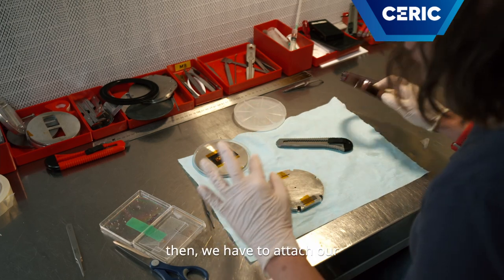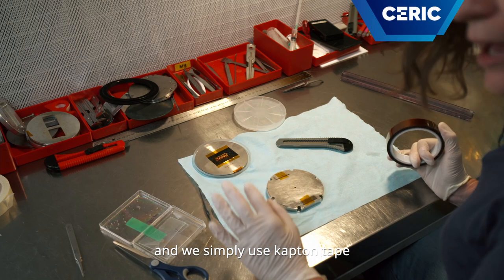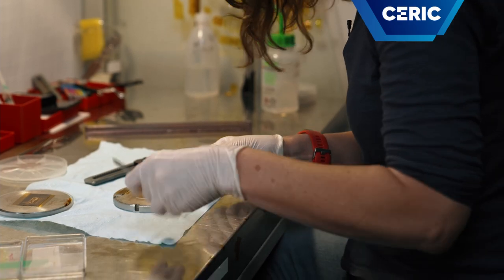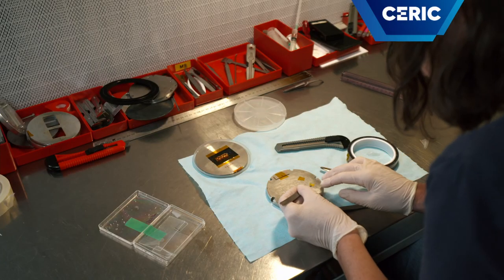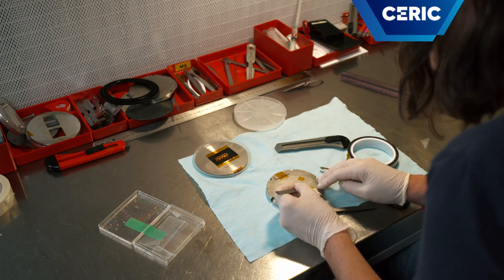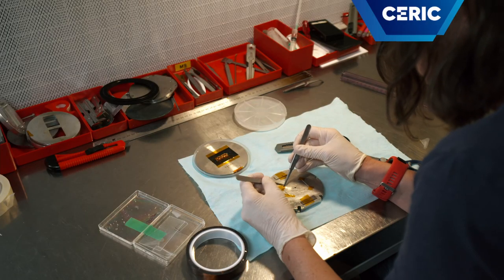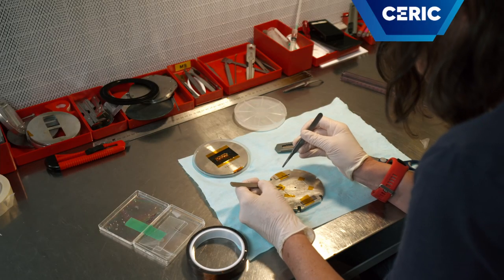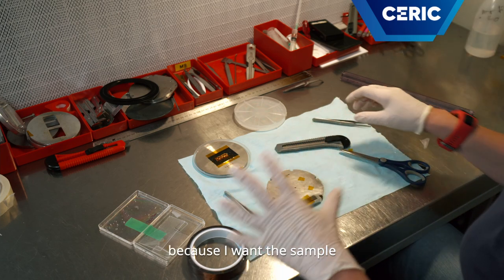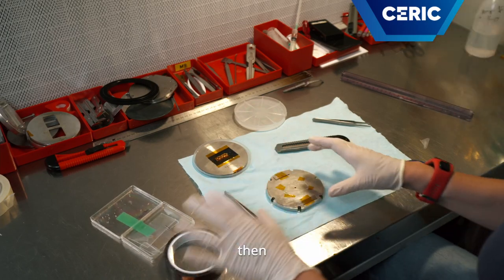Then we have to attach our plastic on the substrate and we simply use Kapton tape. I put four pieces of tape because I want the sample as stable as possible during the radiation process.